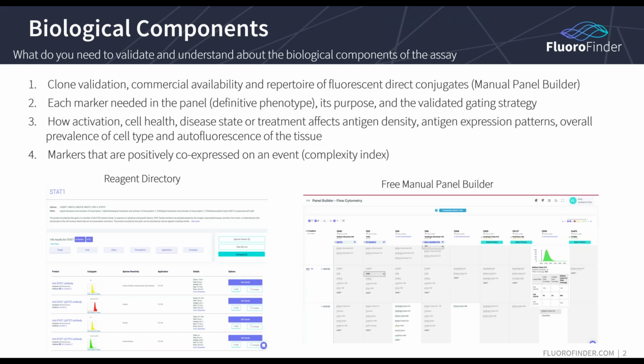So for those of you who aren't uber dorks in flow cytometry like the rest of us, there are a lot of behind the scenes standardization committees within the International Society for Analytical Cytometry. They're called ISAC, and it's a meeting that a lot of us attend regularly. It's an overview of technology and reagents and things that are advancing within cytometry. And within that cohort, there are all these subgroups that are trying to standardize things like definitive phenotypes.